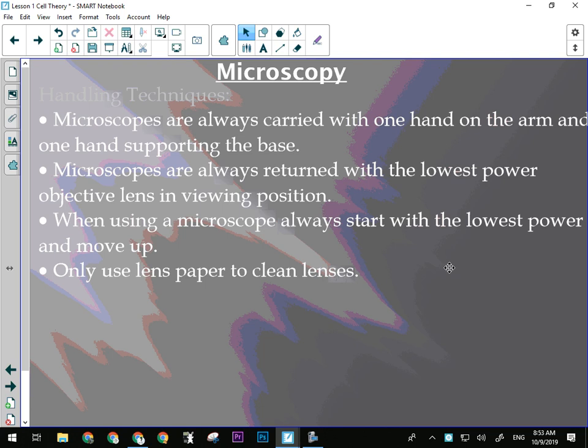Okay, now this actually does have a brake as well, but it's much further past where the other one goes. All right. On here as well, there's a light source. Down in here, that can be turned on with the switch on the back. On, off. Very simple. Yes, it's in the on position.